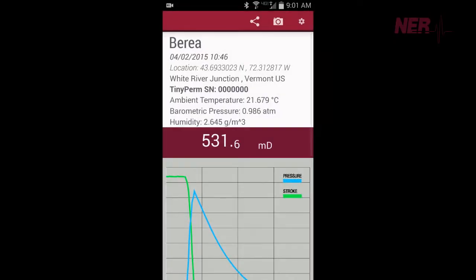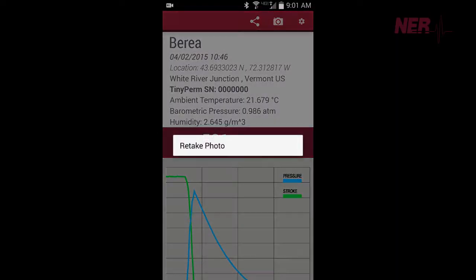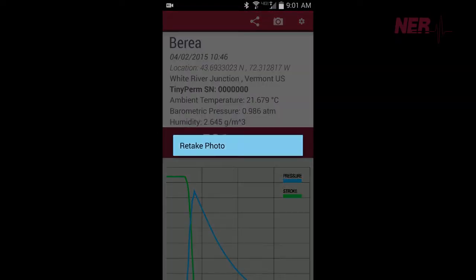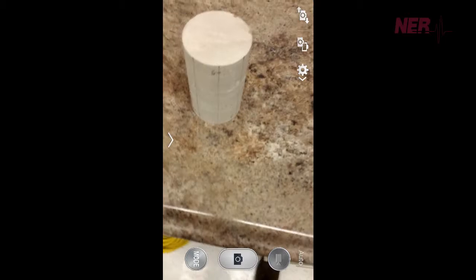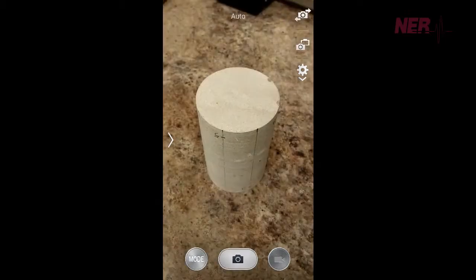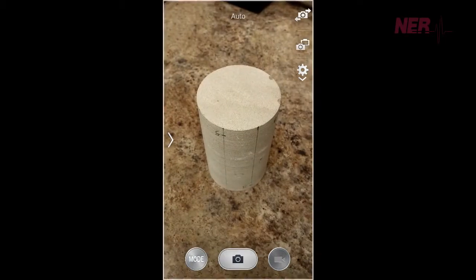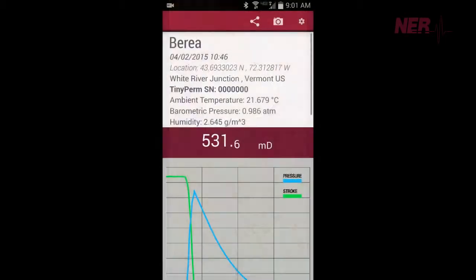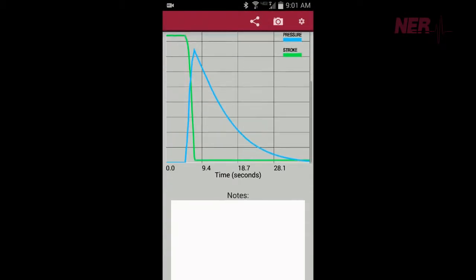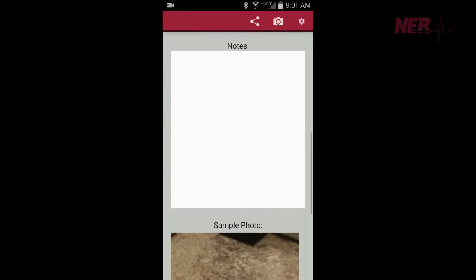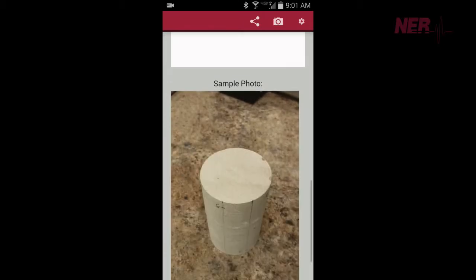Along with the permeability data, a photo of the sample can be stored in association with the measurement. Optionally, you can be prompted to take a photo after each measurement.